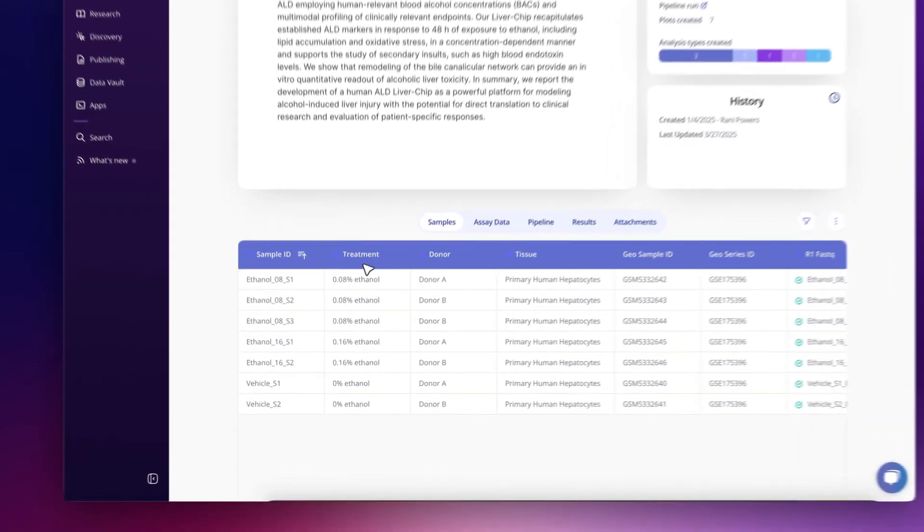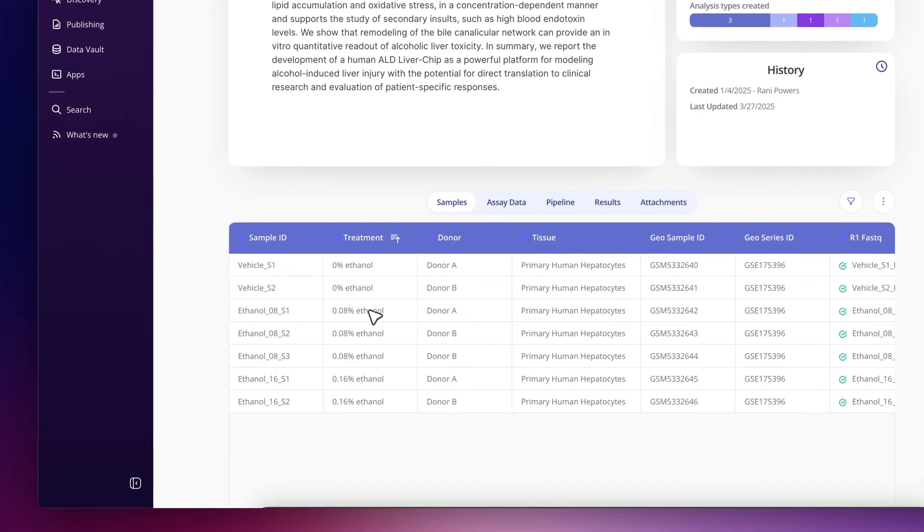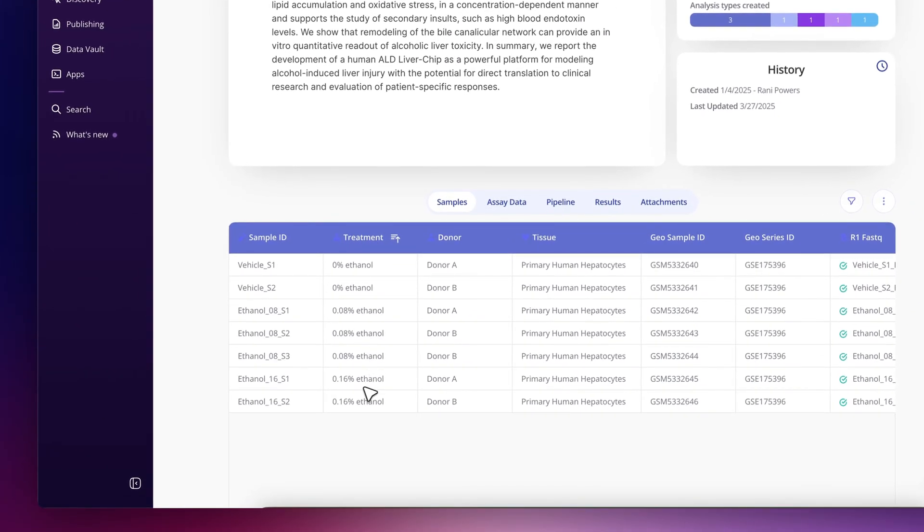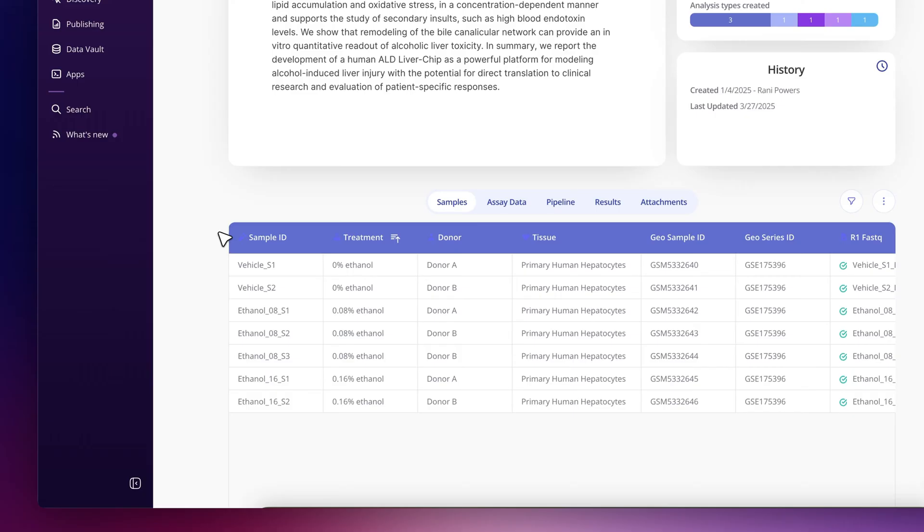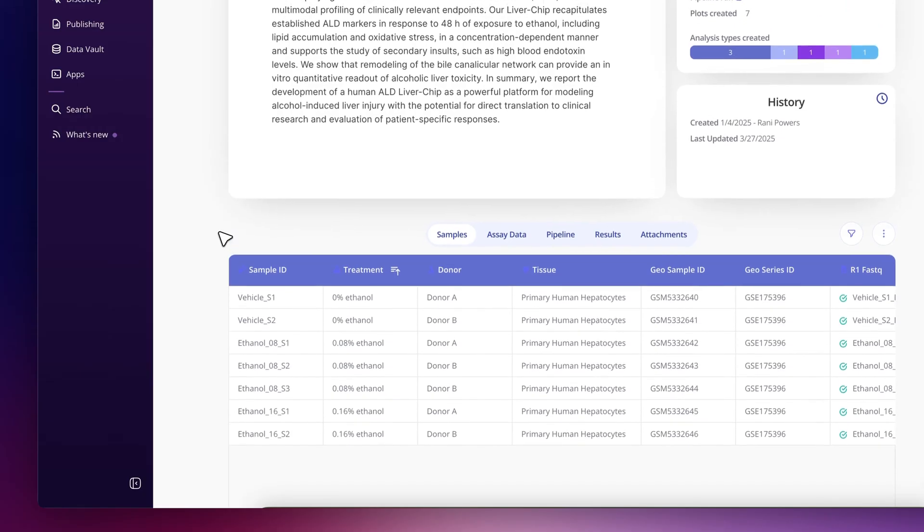You can see there were two different doses of ethanol treatment used in this study, as well as two samples with no ethanol. These human liver chip models came from two different donors indicated by donor A and B here, so there's plenty to analyze.